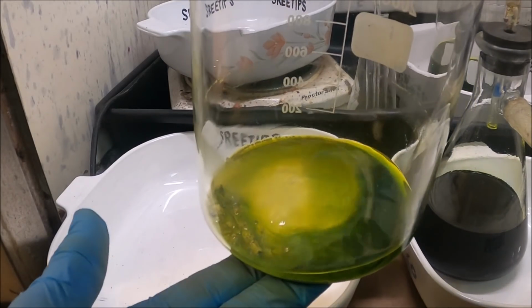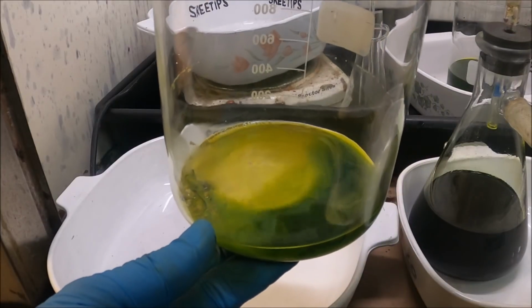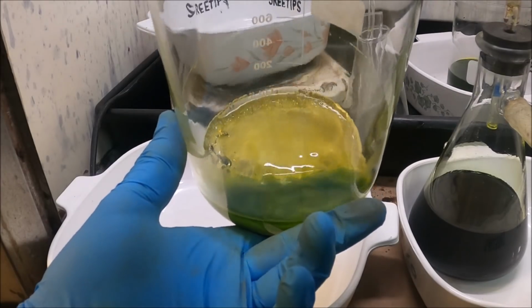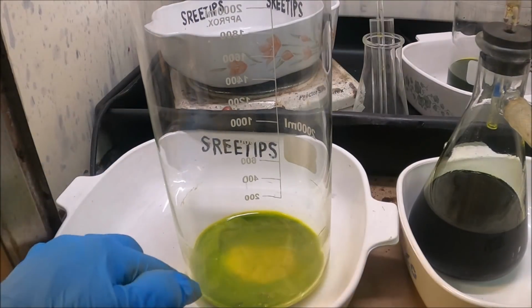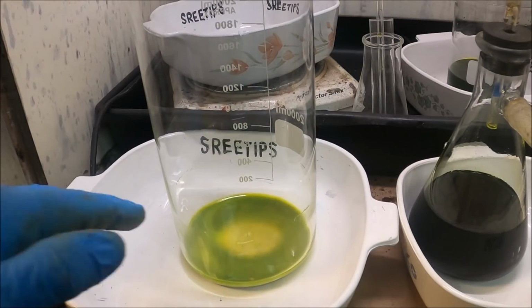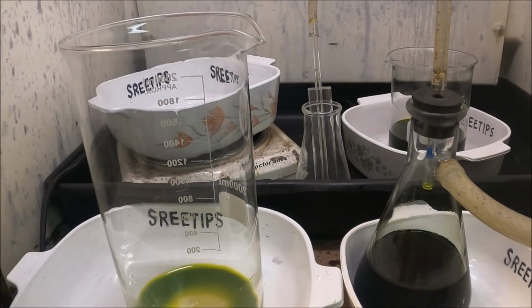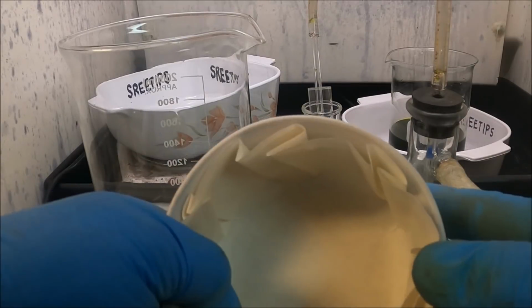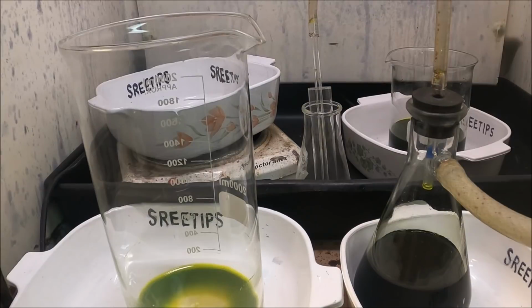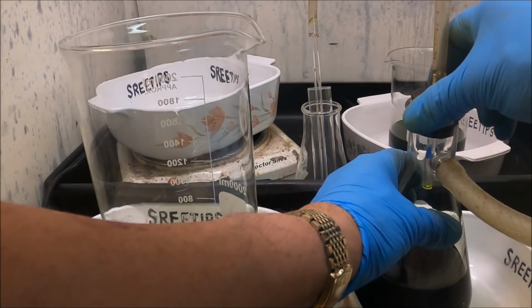What we'll do is I'm going to put this into a filter and get the rest of the solution off. And then maybe we'll hit the rest of these solids inside this beaker with some more aqua regia. I prepared one of my special filters here. What we're going to do now is try to filter the rest of this solution into this flask.